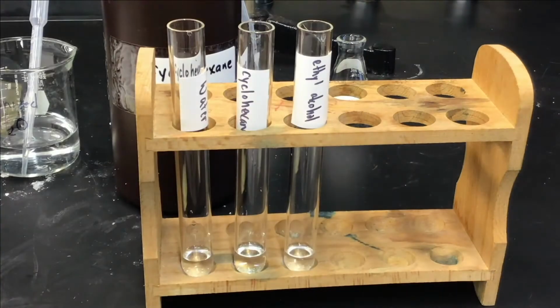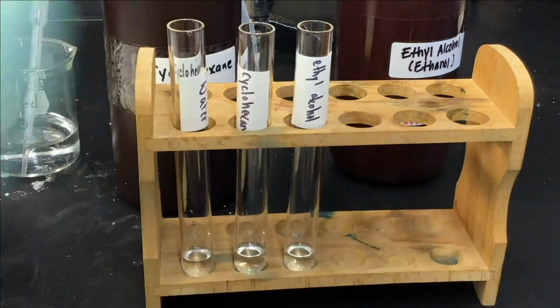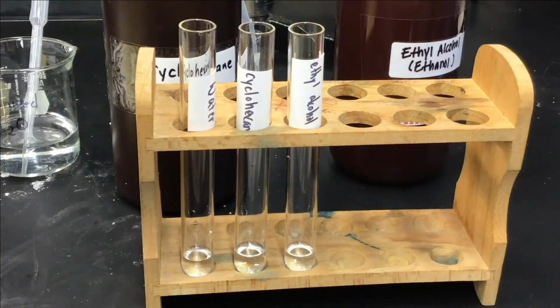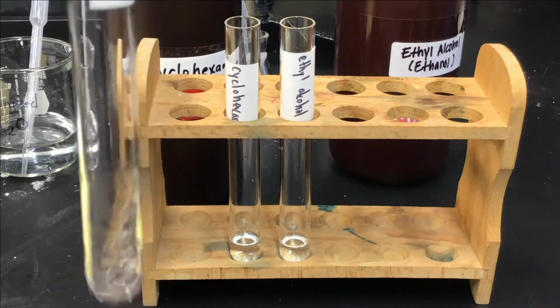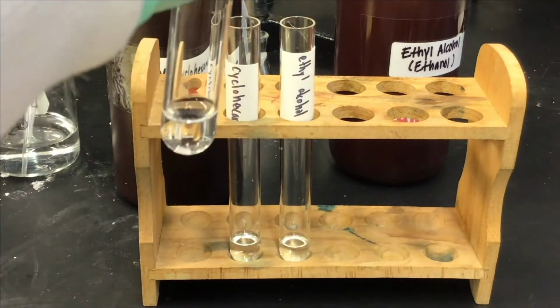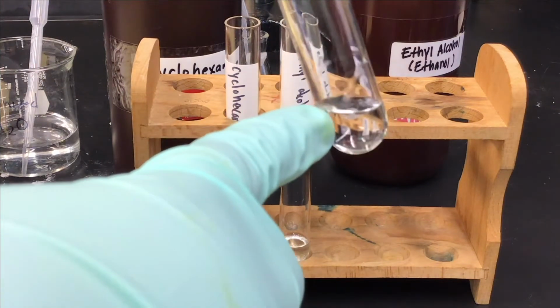And then we're going to put a couple of crystals of our unknown into each one, stopper, shake, and see if our unknown is soluble in each test tube. As you can see, we still have crystals of our unknown visible in our water test tube.